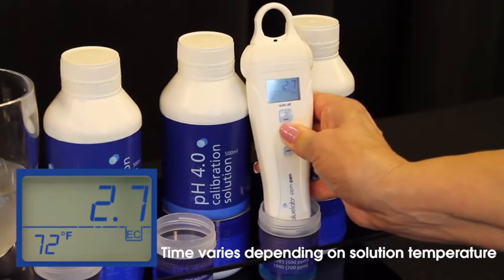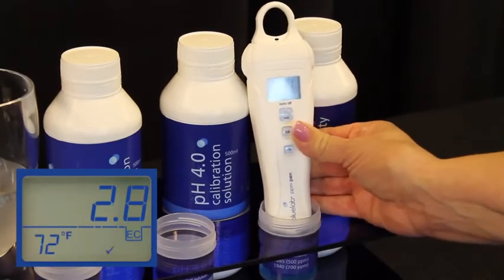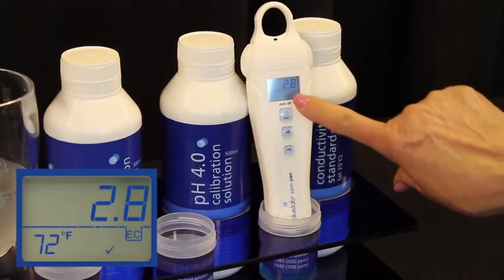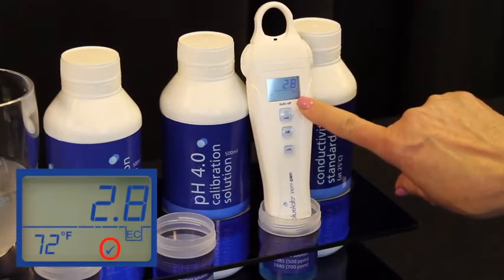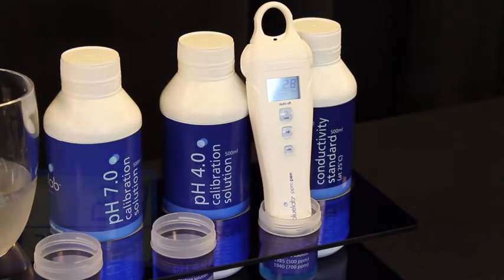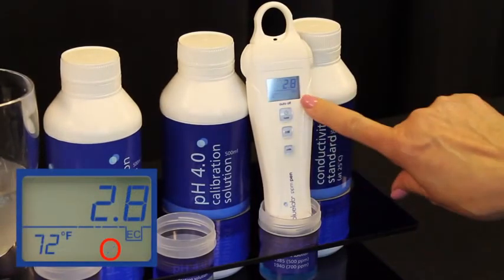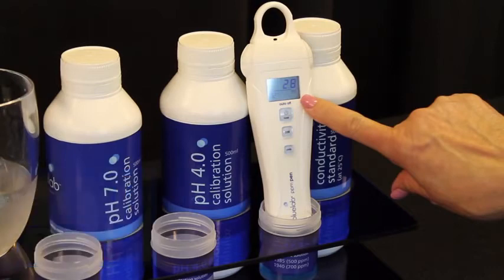Press the cal button down on the pen while it's in the solution and wait until it says Cal on the screen. You know you have a successful calibration when the check mark shows on the bottom of the screen. Now you are calibrated and ready to use. The check mark will disappear after 30 days, which means it's time to clean and calibrate your PPM pen again.